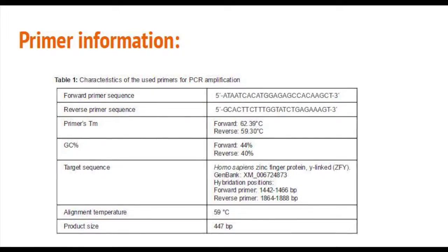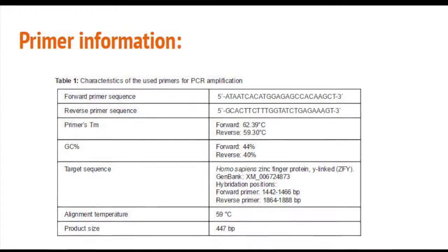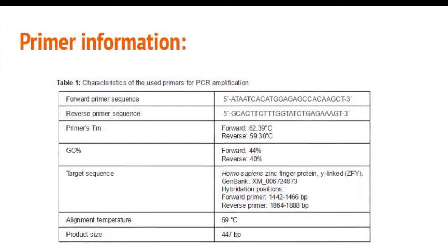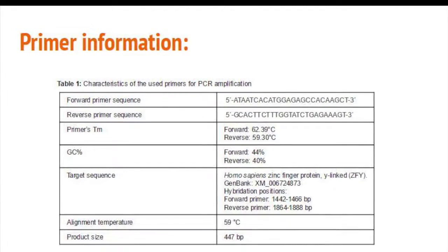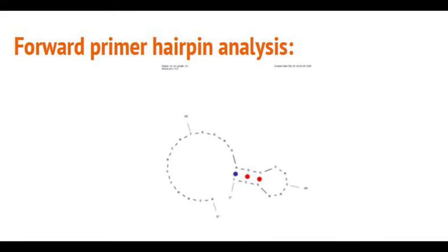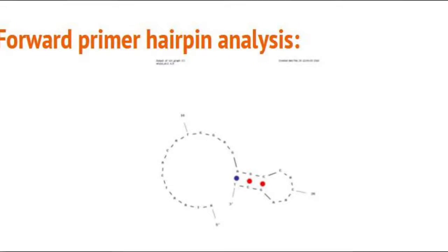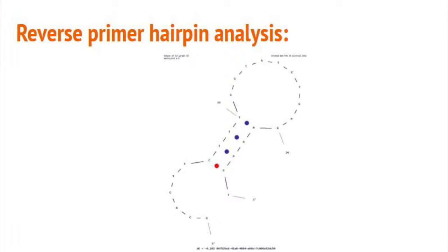The following primers were designed to hybridize the ZFX and ZFY genes, which are homologous genes on the non-pseudoautosomal parts of the sex chromosomes. The amplification of these genes and their further visualization in an agarose gel is one of the methods for sex determination. An Alu element is inserted into the last intron of the ZFX, so when PCR is performed and these designed primers are used, which amplify this intron from both genes, the resulting size difference is readily resolved by agarose gel electrophoresis.